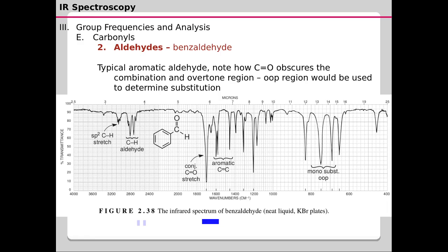Okay, and that can be really discerned because there are no sp3 CH here, rather we have sp2 CH, which absorbs slightly towards the higher frequency end of the spectrum. That means about 3000 centimeter inverse, which makes it further away from the Fermi doublet.